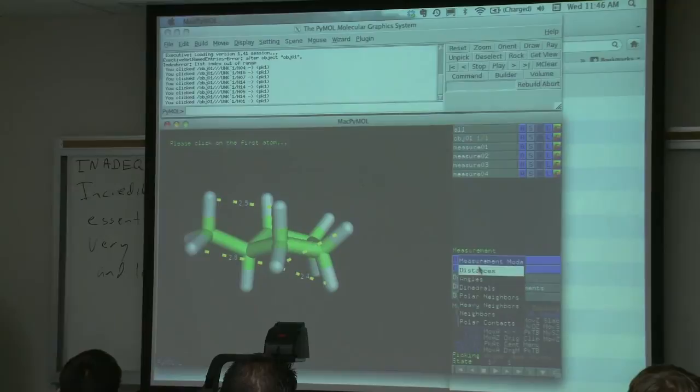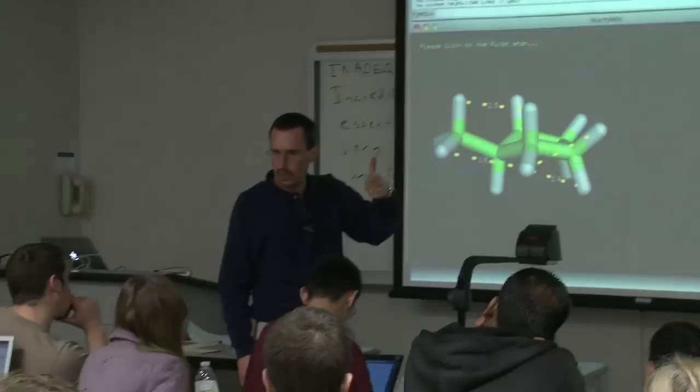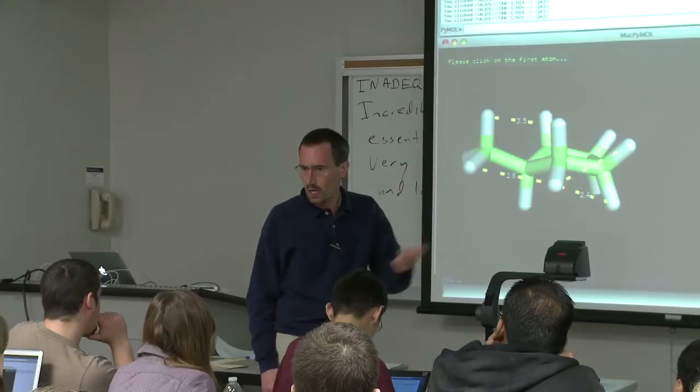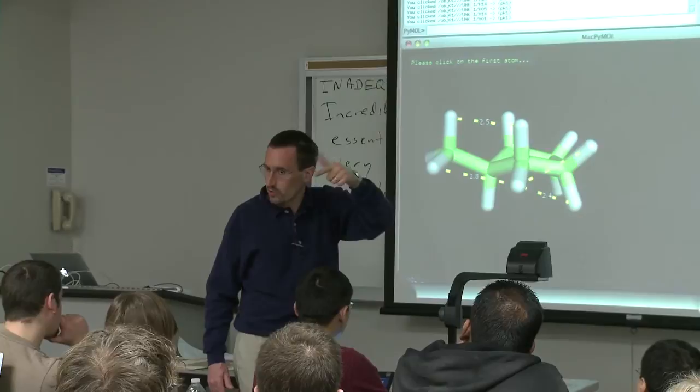So remember that coupling constant calculator, and we did it two ways. One was by taking it onto the modeling facility computers and using MacroModel, which had a Karplus calculator built in. The other way was a website that linked to the Tetrahedron paper on typical J values with different substituents. If you just wanted to use the website, you could just get your dihedrals. You pull dihedrals there, you click on the four atoms, hydrogen, carbon, carbon, hydrogen. You get your dihedral, and you put in your substituents on the pull-down menu on that Tetrahedron calculator.